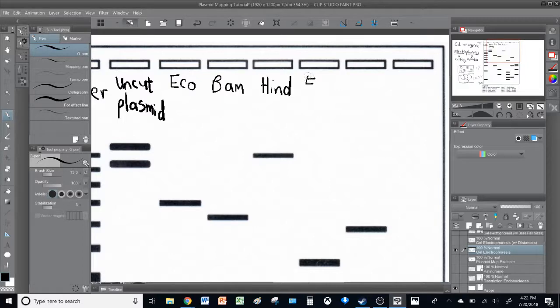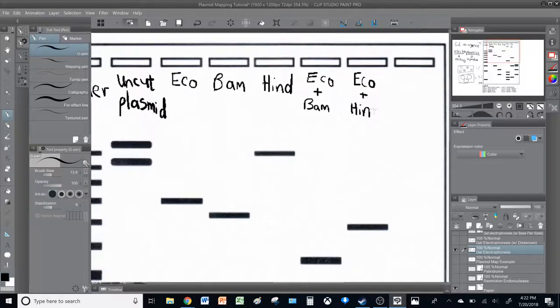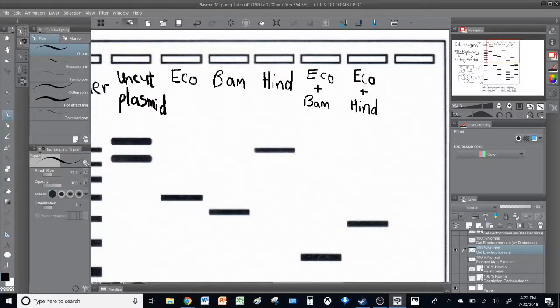This is ECO and BAM, if I recall. This is ECO and HIND. And the last one is BAM and HIND.